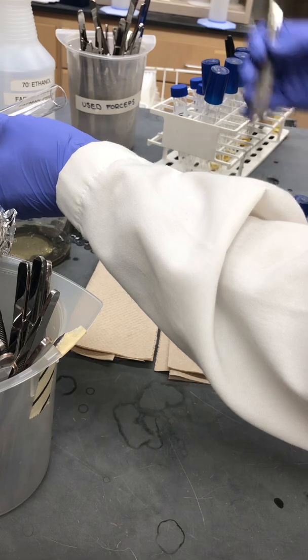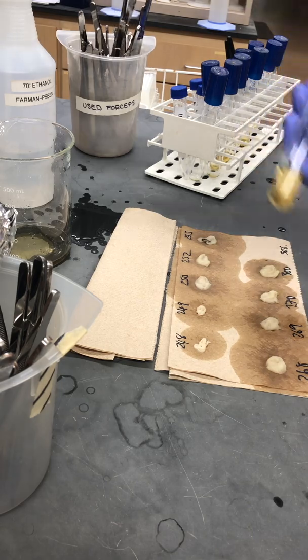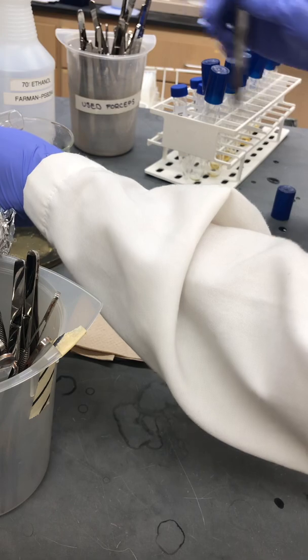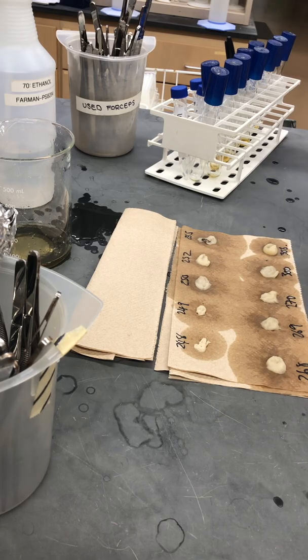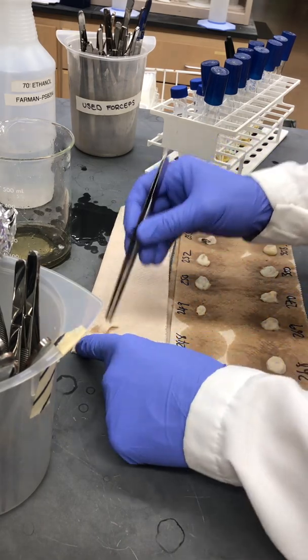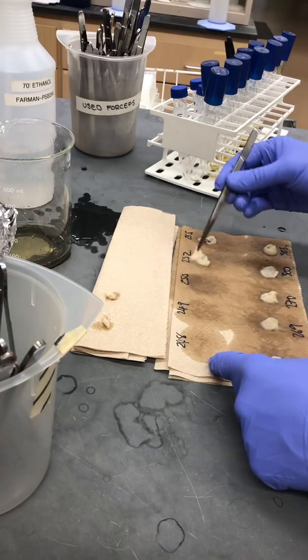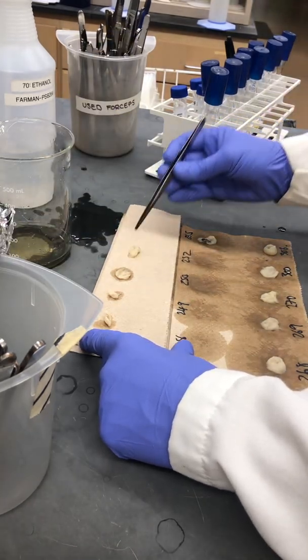We'll just let those blot on the paper towels until the towels have soaked up a fair bit of liquid, and then we will transfer each pellet to a fresh towel just to get the remaining liquid out. We can give them a little pat to squeeze some of the liquid out if we want to speed up the process.